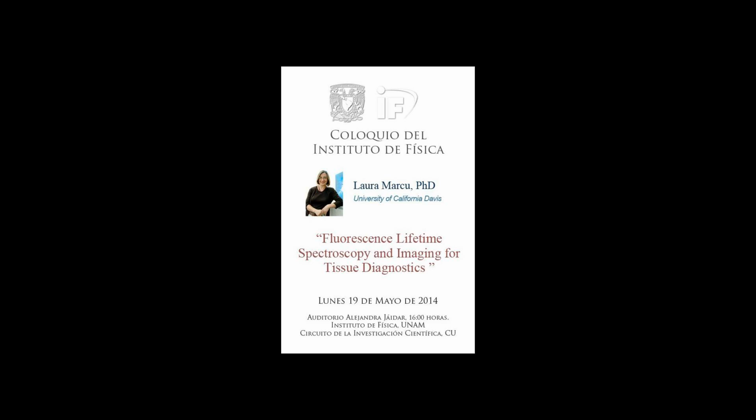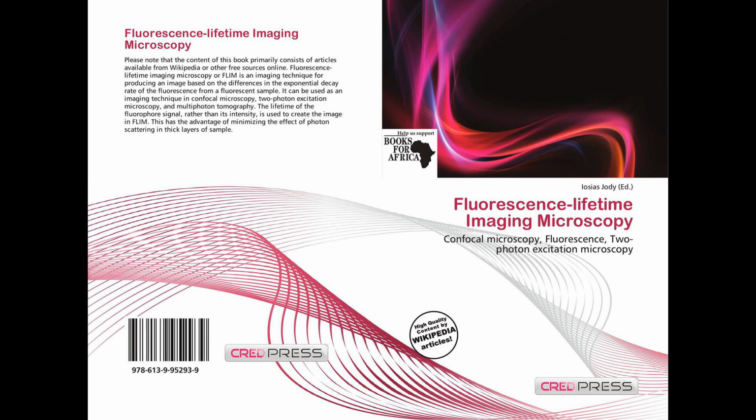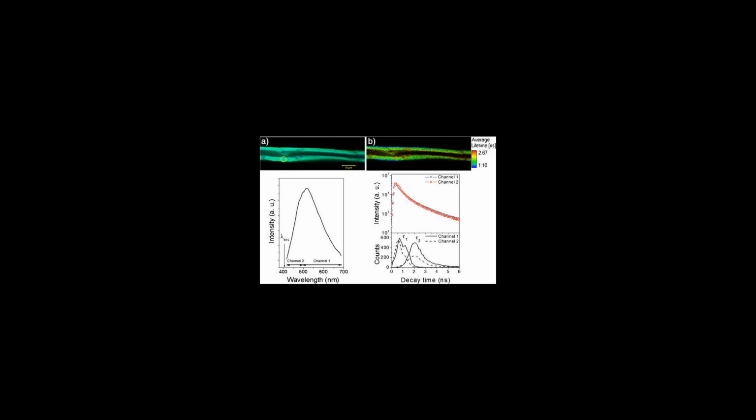I(t) = I_0 e^(-t/τ), where 1/τ = Σ k_i. In the above, t is time, τ is the fluorescence lifetime, I_0 is the initial fluorescence at t = 0, and k_i are the rates for each decay pathway, at least one of which must be the fluorescence decay rate, k_f.